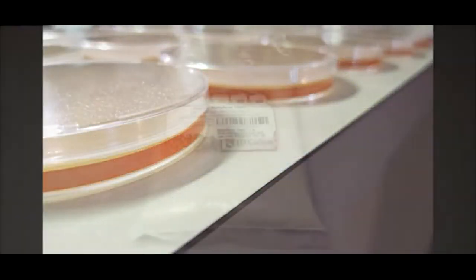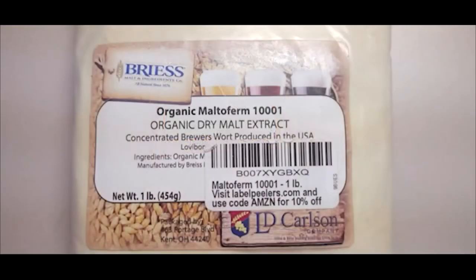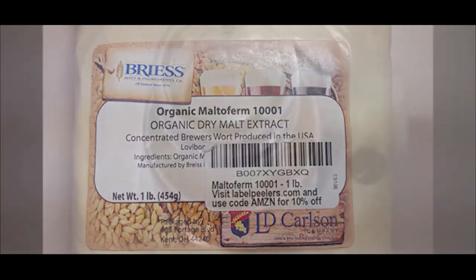There seems to be some confusion around malt extract and light malt extract. There are various malt extracts including light, amber, extra light, pilsen, wheat, rye, and even dark extracts, which are used for brewing various styles of beer. All indicators show that any malt extract will work, but it seems that light malt extract is preferred in mycology. The malt extract we use and that is shown in our videos is actually a light malt extract.